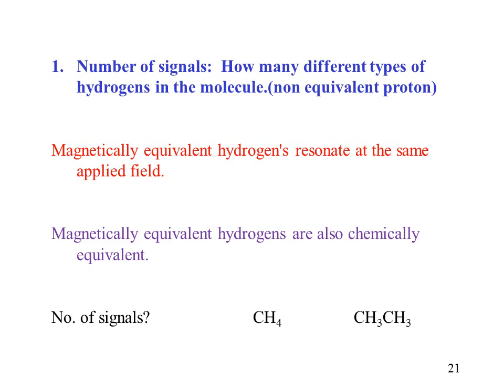Now we start with the first information that can be obtained from the NMR spectrum. First point, number of signals. It gives an idea about how many different types of hydrogen are in the molecule, in other words, non-equivalent protons.